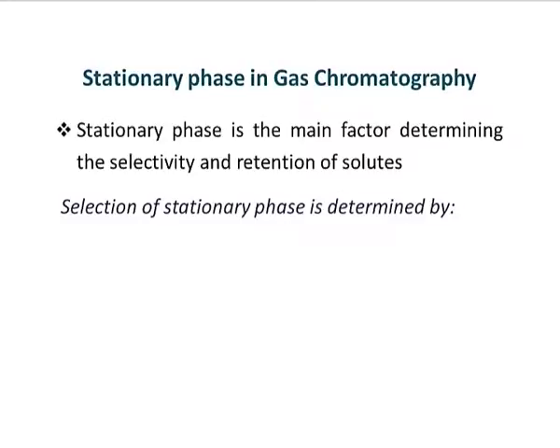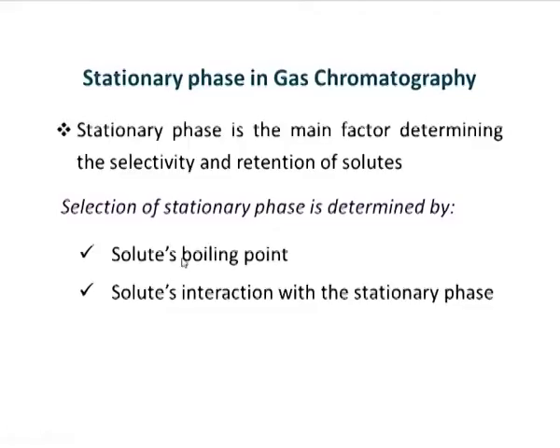So, the selection of the stationary phase is equally important, and it is generally determined by the solutes, the kind of boiling point the solutes have, because the separation would be governed by the different boiling points of the solutes. Nevertheless, the solutes' interaction, their adsorption, their partition into the stationary phase would also be a factor, but their boiling point is a very important factor for resolution and their separation. And secondly is the solutes' interaction with the stationary phase.